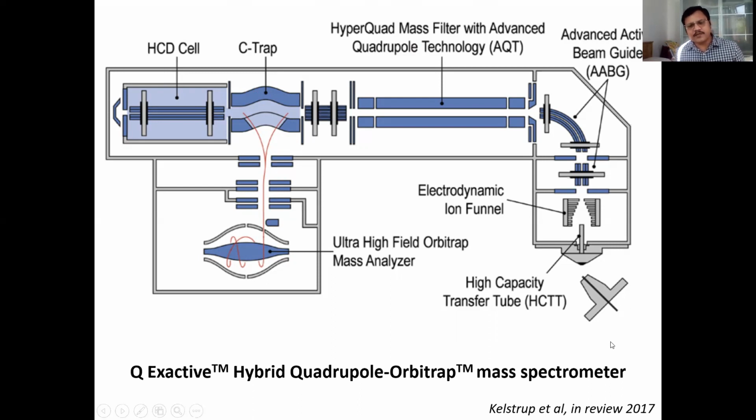Once we get the peptides labeled, we fractionate them further with reverse-phase liquid chromatography. We get different fractions of the peptide samples, and we transfer them through the high-voltage electrospray ionization, where they get evaporated and ionized. The ionized molecular ions, or peptides, pass through the quadrupole analyzer, where we select certain ions based on their mass-to-charge ratio. Unwanted peptides just get destroyed in the quadrupole.